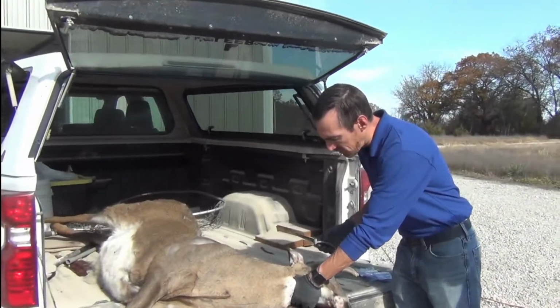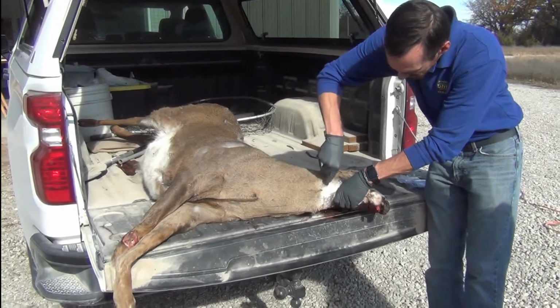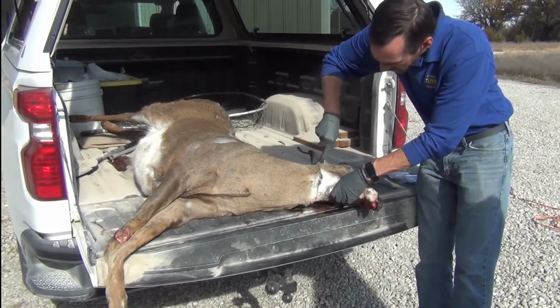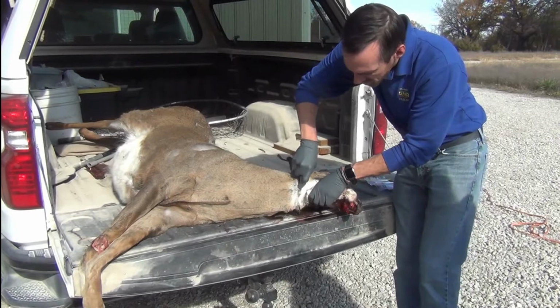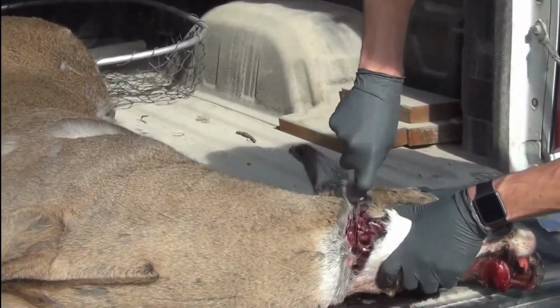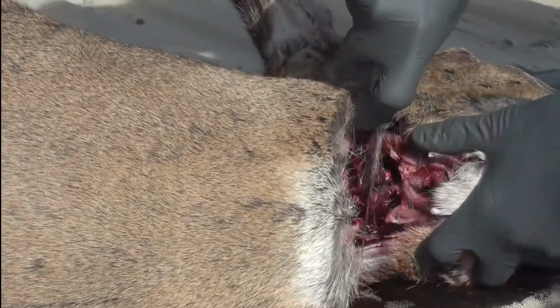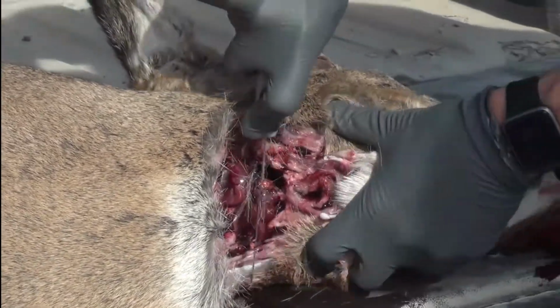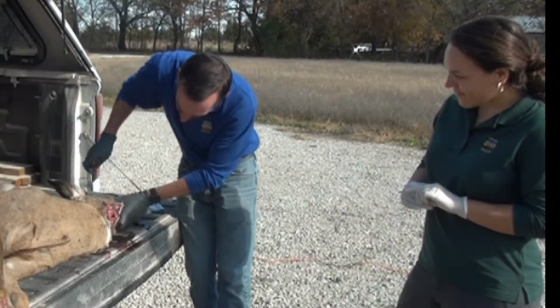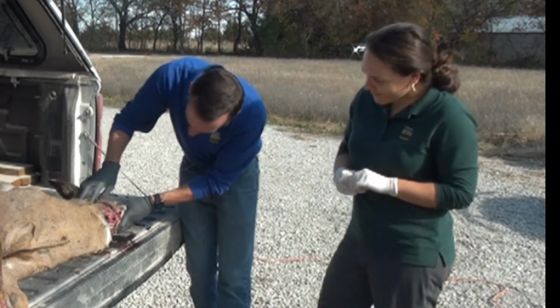Okay, so again, feeling for the bottom of the jaw there. Make one straight cut up towards the ears, just like that. And you want to make sure you cut all the way through the trachea so that you can get access to the tissues. So you can see as we're cutting here, we're getting it so that we can peel that head back and get access to the tissues in there.